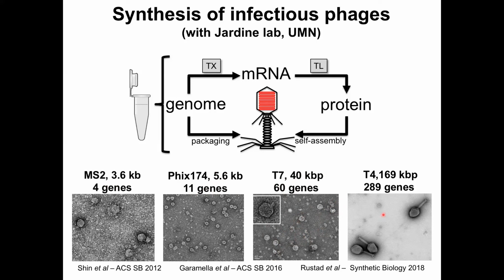And the last one that we have done in 2018 is to show that the T4 phage, which is 169 kilobase pairs and almost 300 genes, is fully synthesized in a cell-free reaction. It is currently the largest DNA program that has been expressed in a cell-free reaction to give a functional unit, which is a T4 phage.